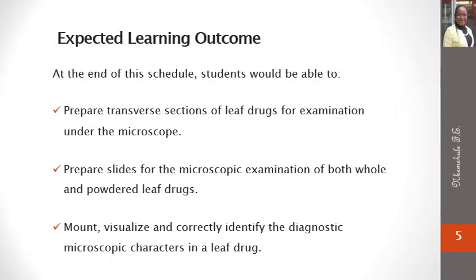At the end of this schedule, students will be able to prepare transverse sections of leaf drugs for examination under the microscope. You will know how to prepare slides for the microscopic examination of both whole and powdered leaf drugs, as well as mount, visualize, and correctly identify the diagnostic microscopic characters in a leaf drug.